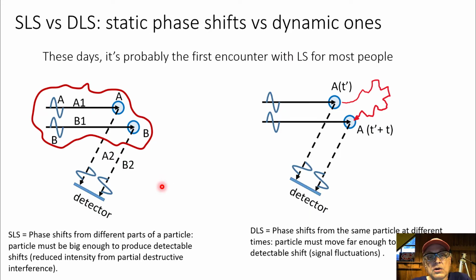And what I would encourage you to do is to think back to when we were talking about phase shifts. So this figure here, we've already seen this figure on the left. And we have some scattering blob. It's some sort of giant protein or aggregate, or maybe it's just some weird shaped polymer at one instant in time.